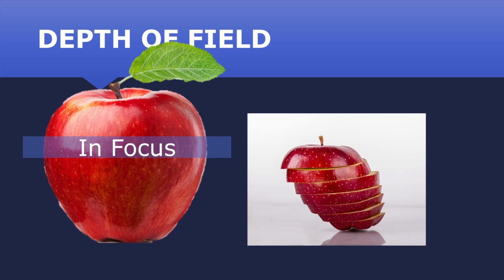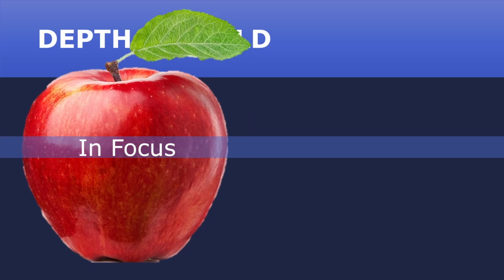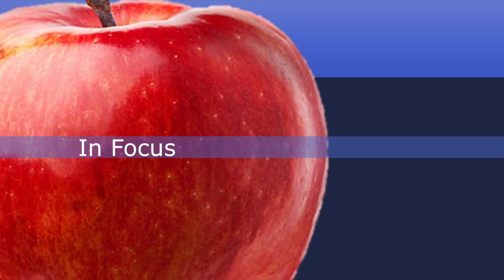As you swap to higher power objectives, magnifying the image, depth of field shrinks dramatically, so at higher magnification, you should only use the fine focus to avoid moving the specimen far away from your fragile slice of focus, and risking contact between the slide and lens.